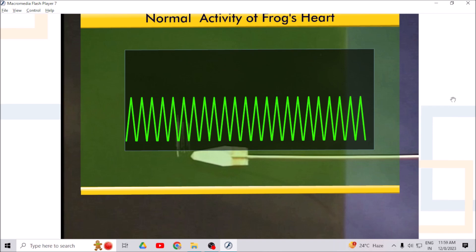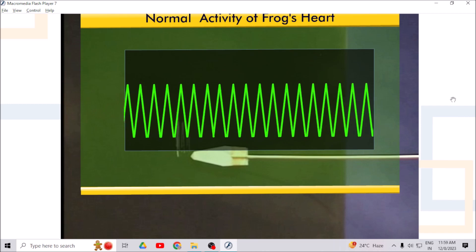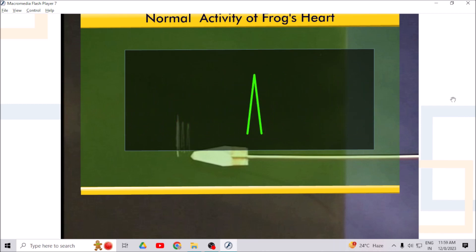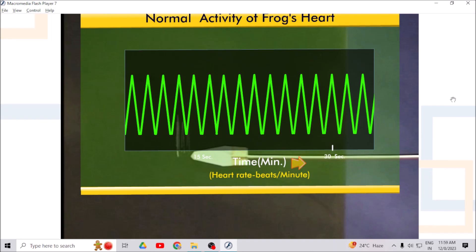This event of contraction and relaxation is observed in the form of a single peak. The upgoing part of the peak represents muscle contraction and the reverse indicates relaxation. In these tracings, the number of peaks per minute indicates rate of contraction of heart, whereas height of a single peak indicates force of contraction.